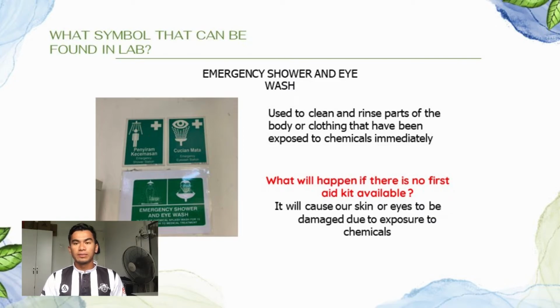Okay, for my part, I will explain about the symbol of emergency shower and eye wash. Emergency shower and eye wash is used in case of a chemical splash. We need to wash the chemical off for 15 minutes before medical treatment.